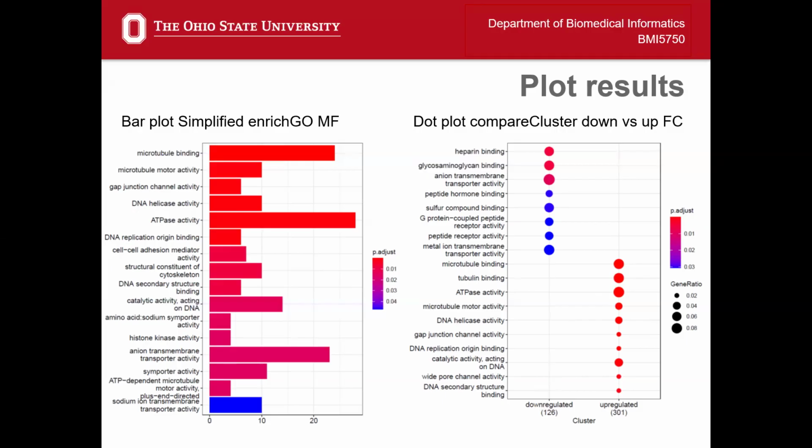This shows us the genes that are upregulated are tagging different functions than genes that are downregulated. So you could imagine our upregulated genes could be oncogenes, could be driving tumor growth and function, whereas our downregulated genes, I don't know, but these are higher in normals.